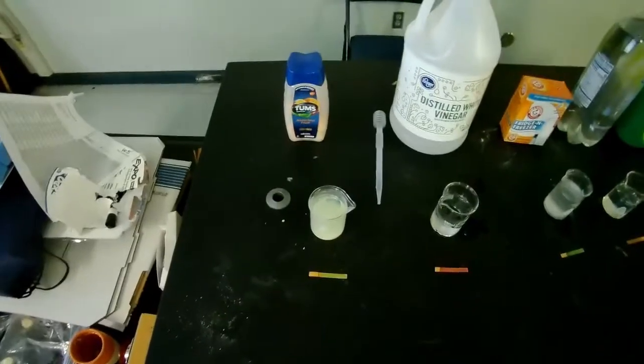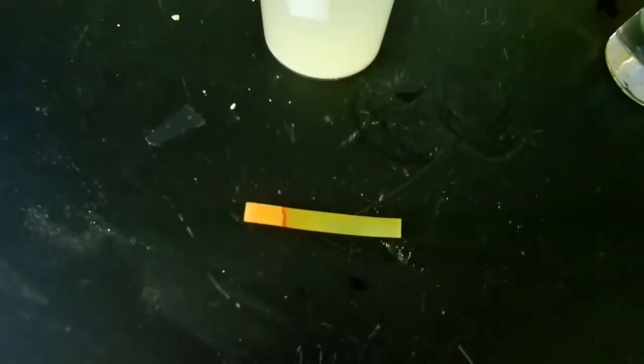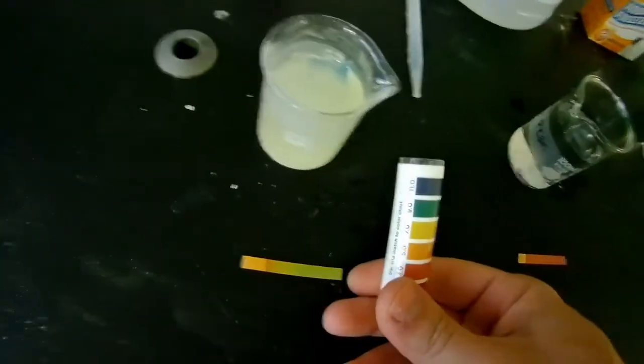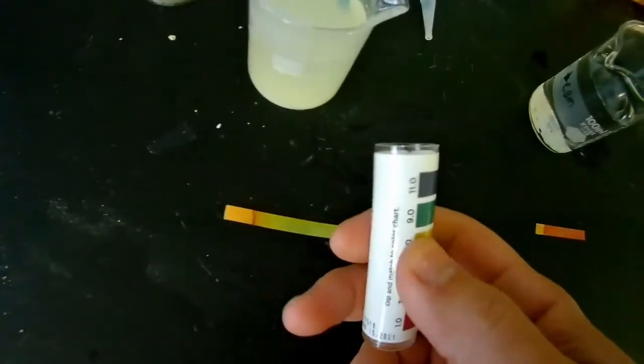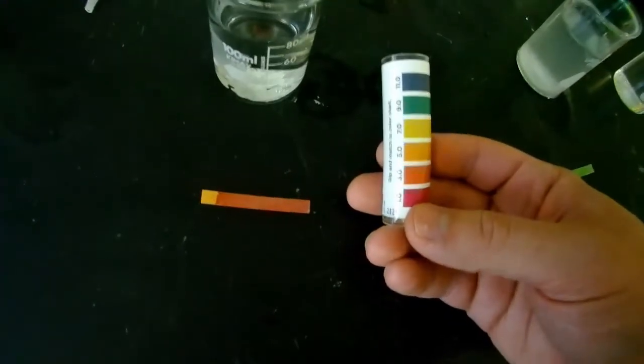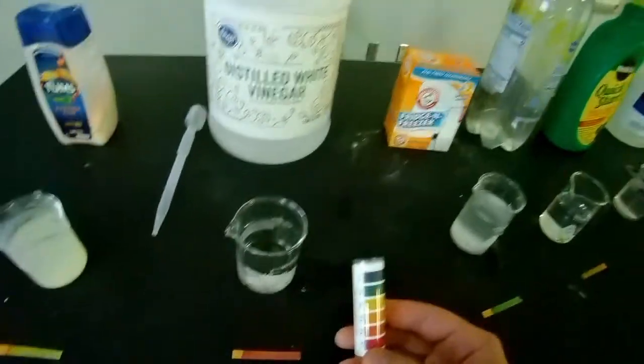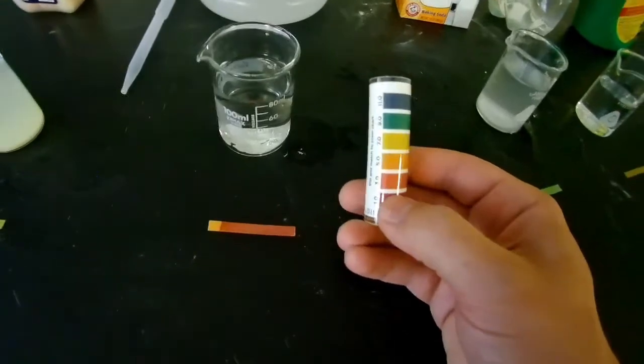Alright, let's take a moment and review our results. With the Tums, we got a kind of greenish color, so that would correspond to kind of a weak base. Greenish color is around a 9, maybe even an 8. That's kind of a weak base for calcium carbonate. For vinegar, we got a pretty deep red color, indicative of a decently strong acid. And that would probably be about a 2 on the pH scale, I would say.